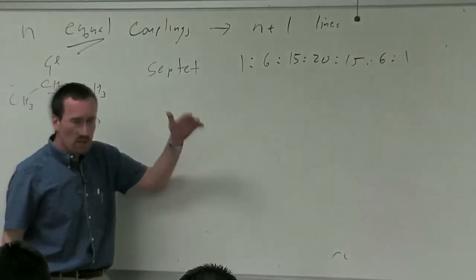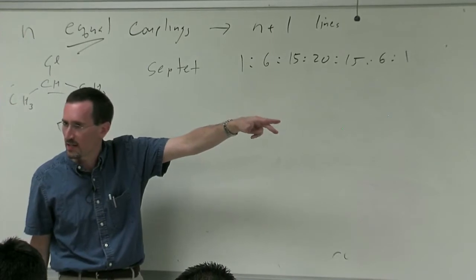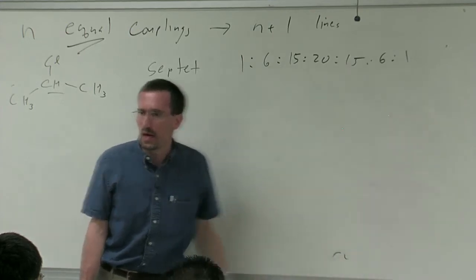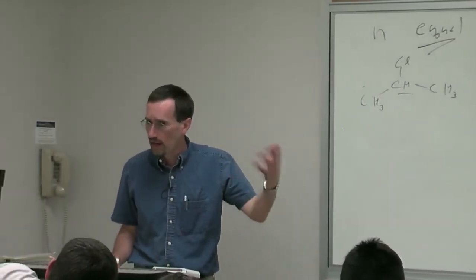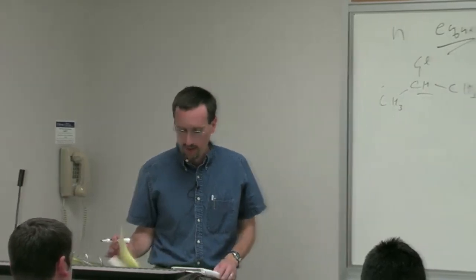And because the septet is going to be very small compared to triplets and quartets in the molecule, unless you look hard, you might not see these lines on the outside. In fact, by the time you get up to very big multiplets like septets, octets, often people will just report them as a multiplet in reporting an NMR spectrum.